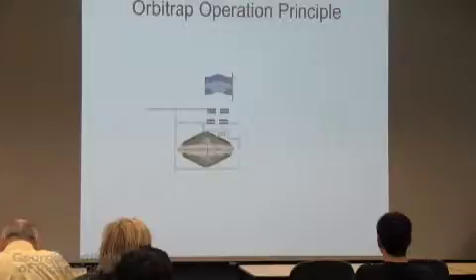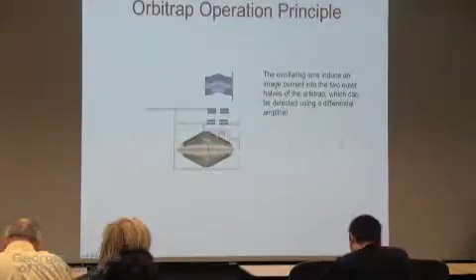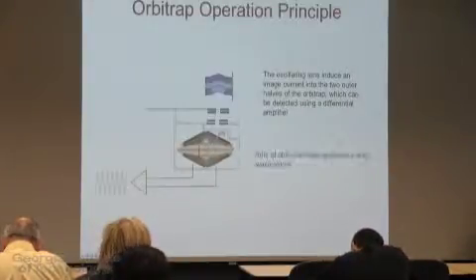So it goes into the Orbitrap, and they oscillate, and this oscillation frequency is proportional to the mass to charge. So if you measure the oscillation over time and apply the Fourier transform to that, you get the frequency of oscillation. That's the mass spectrum, basically. It's very direct. These are very high resolution instruments, and can separate very closely related molecules. That's why we want them.